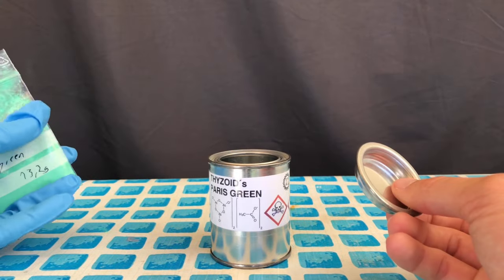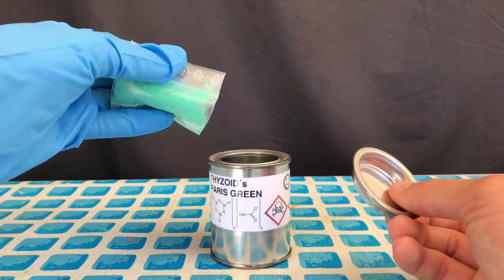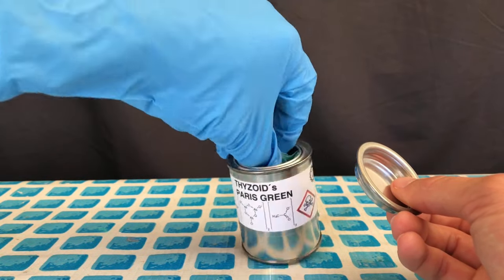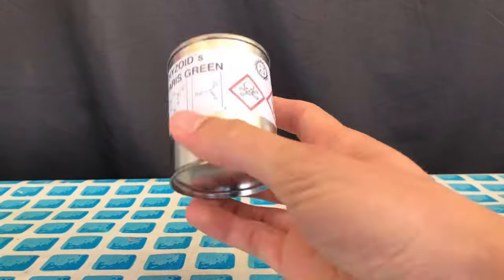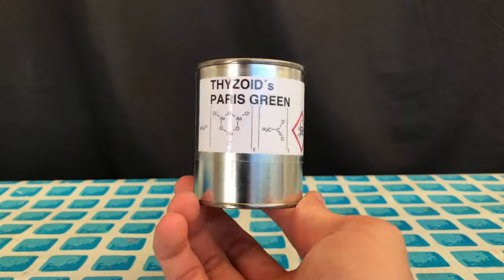For aesthetic reasons and for safety, the plastic bag was put into a steel paint can which has been labeled correctly. I only wore one glove because I didn't want to contaminate the outside of the can, but I still washed my hand very thoroughly afterwards.